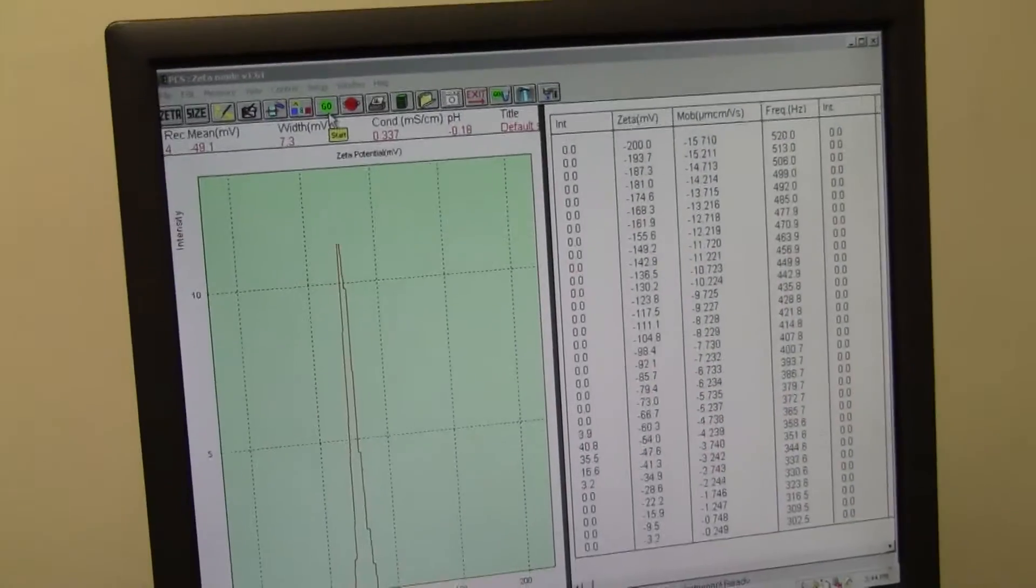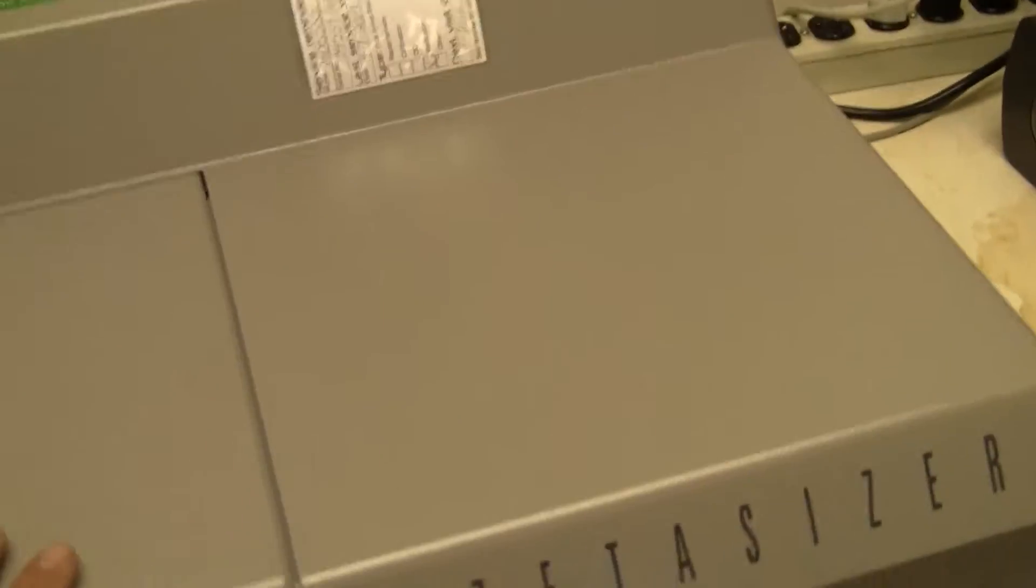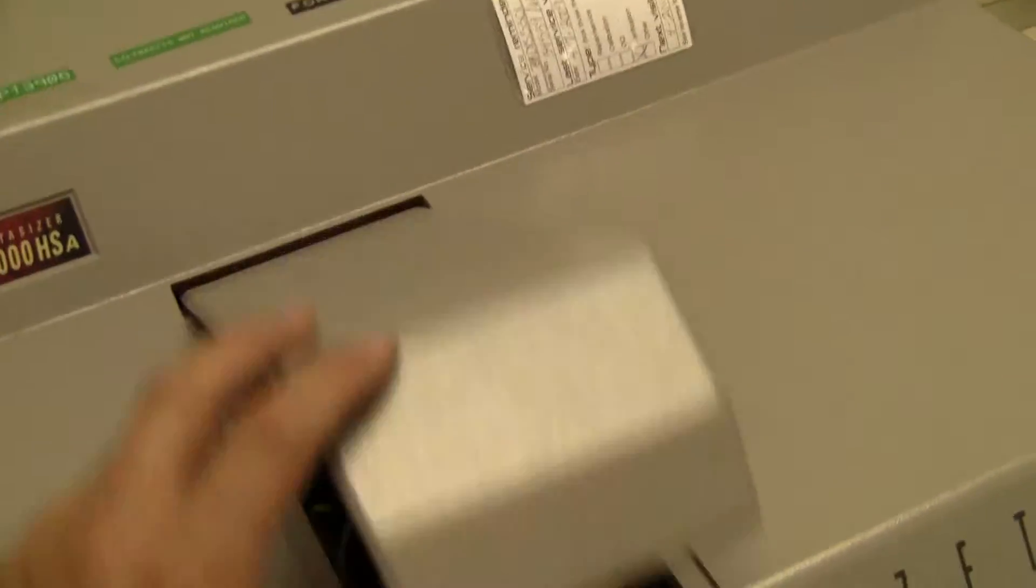So this instrument is ready to be shipped. What I'm going to show you right now is the inside of the sample cell.